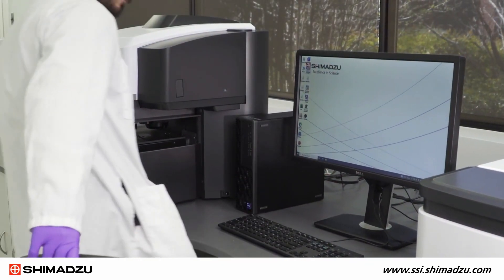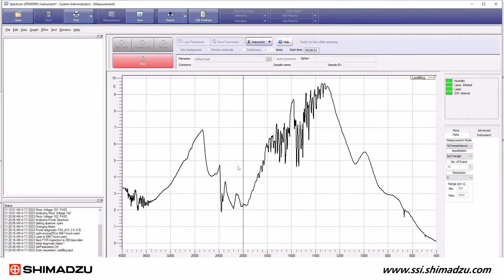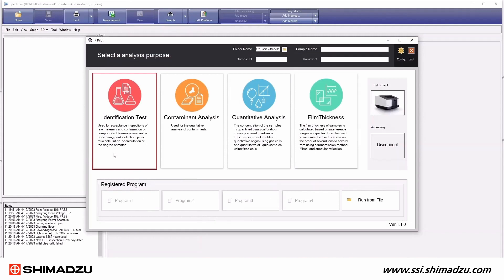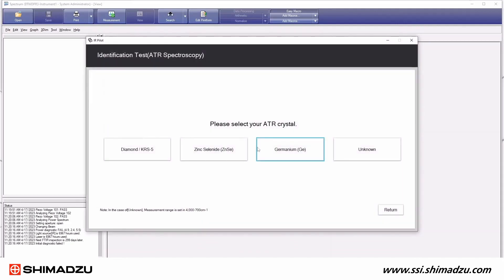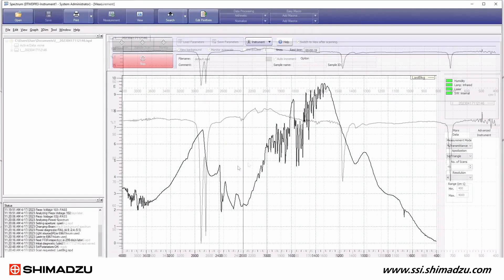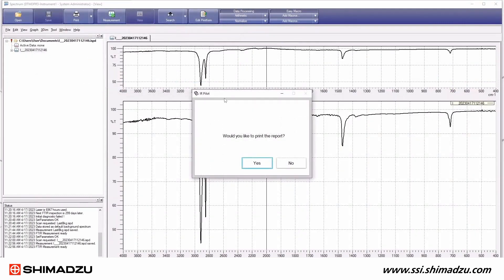The IR CROSS is also equipped with the IR PILOT software. This unique software is an easy-to-use graphical macro interface that provides consistency and speeds up your workflow. IR PILOT gives you the option of four standard measurement modes: identification tests, contaminant analysis, quantitative analysis, and film thickness. You can then click through the software, select your accessory, and answer questions on post-processing steps like labeling peaks, doing an ATR correction, or printing a report.